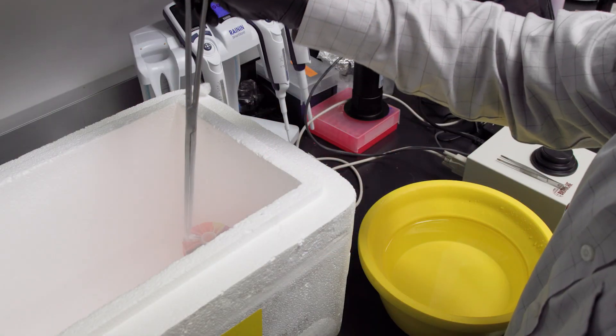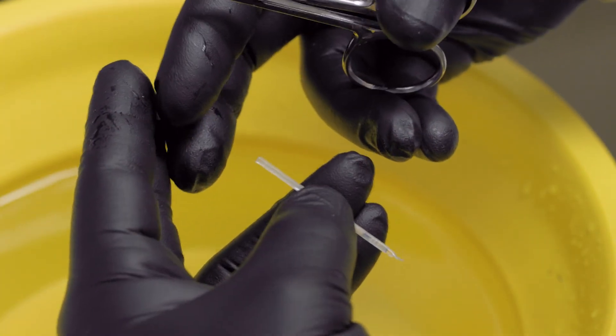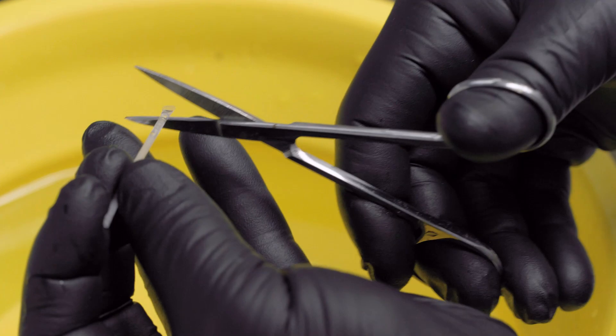When it is time to utilize the sample, straws are thawed in a 40-degree Celsius water bath for about 10 seconds. The plug and sealed ends are cut off and the straw is then inserted into the insemination system.